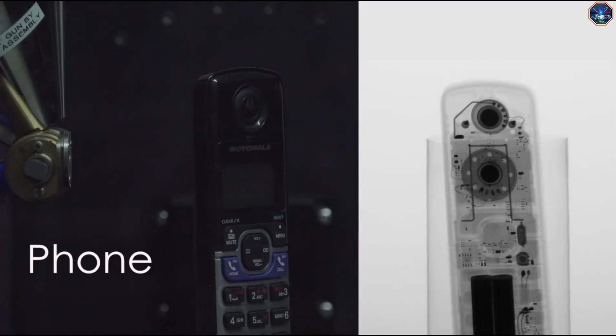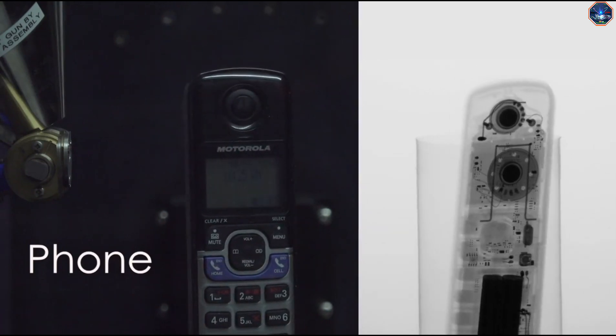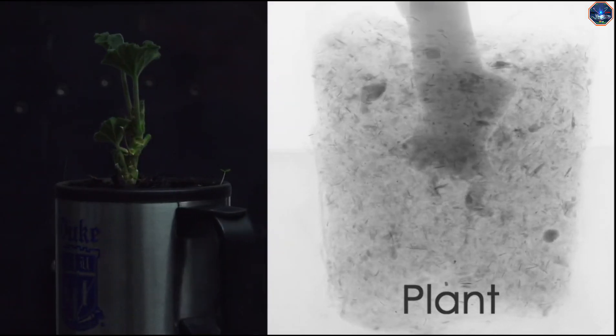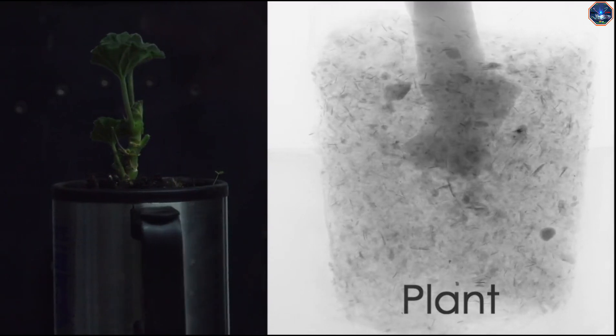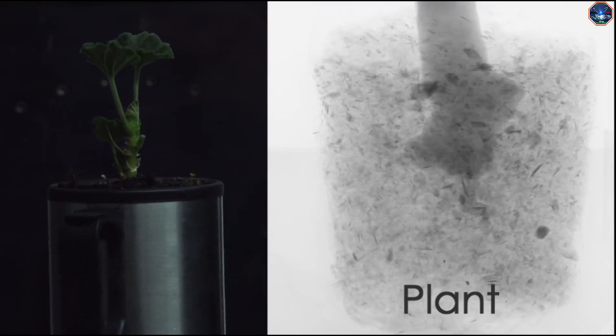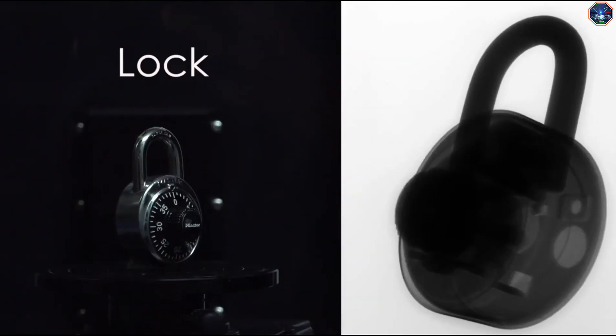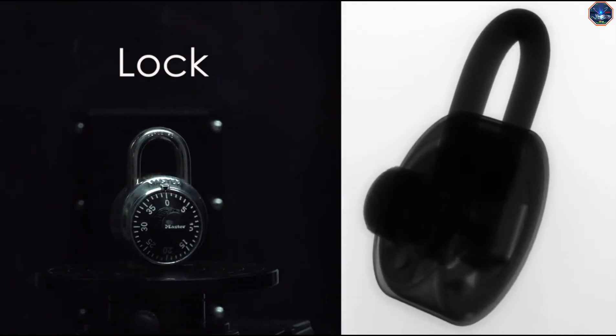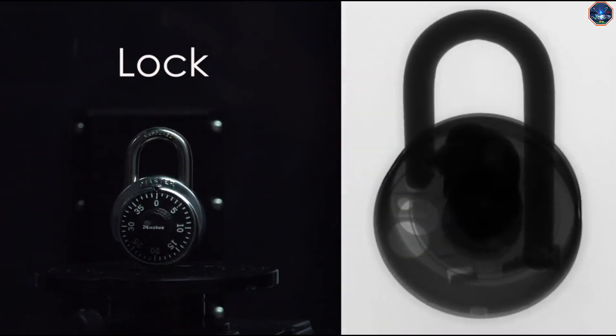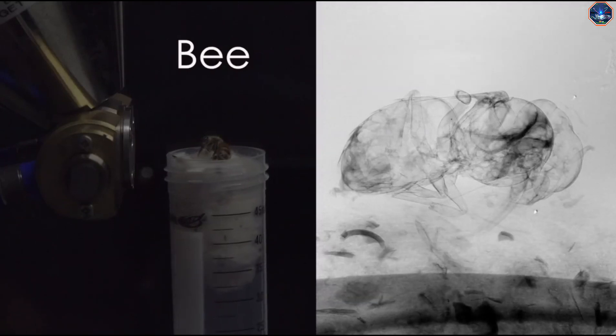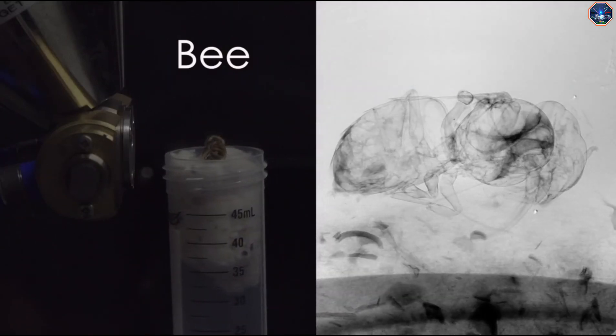The stage that holds the samples in the MicroCT spins around while the rest of the equipment stays stationary. This is unlike a CT scanner in a doctor's office where the machine wraps around a patient. Because the stage spins, everything needs to be carefully positioned in order to stay in the field of view.